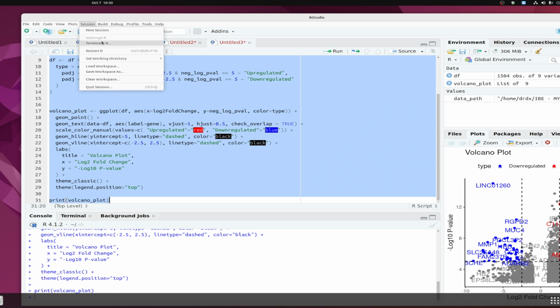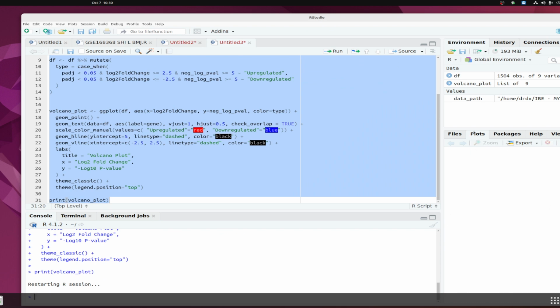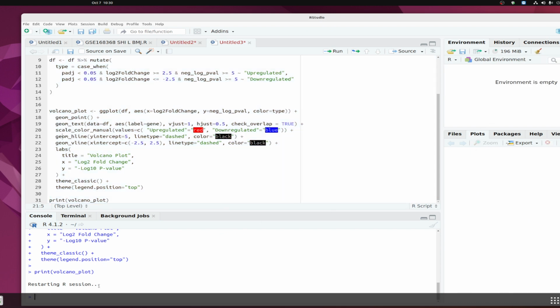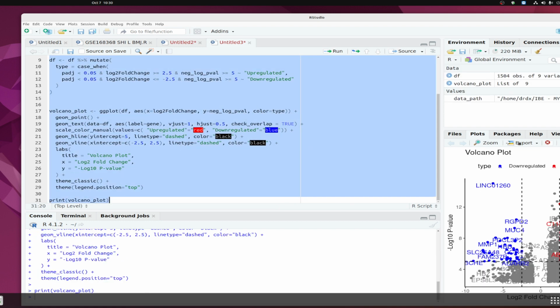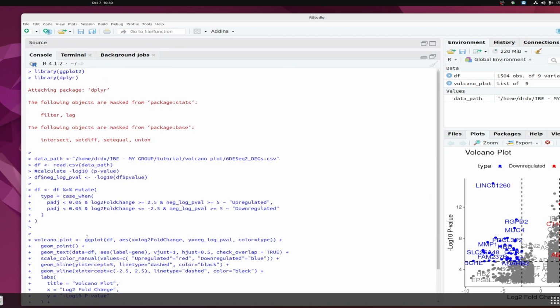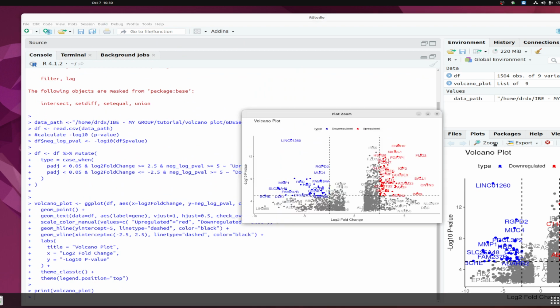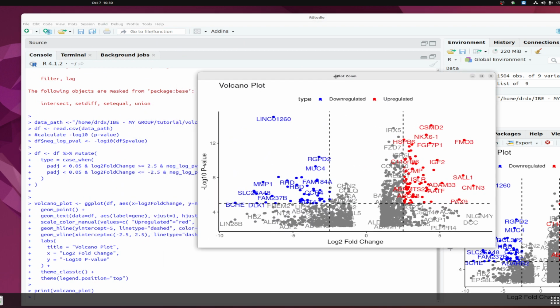Let me show it again, as there was some mistake in there, sorry. So you wanted to regenerate, Control L, delete everything, and just click on this, and your data is run. So if you want to go in here, you can see what are the packages loaded, how it is functioning. And then if you want to see the figure, this is the figure in R.